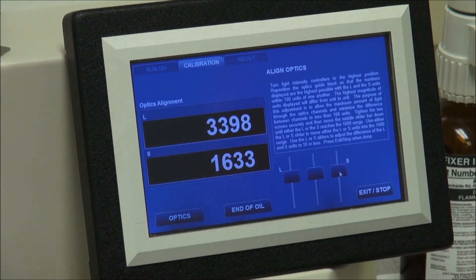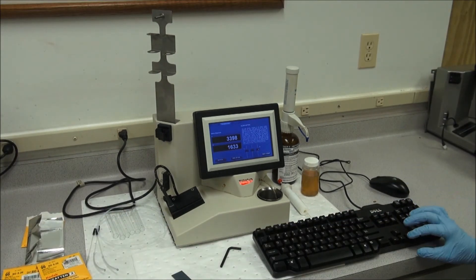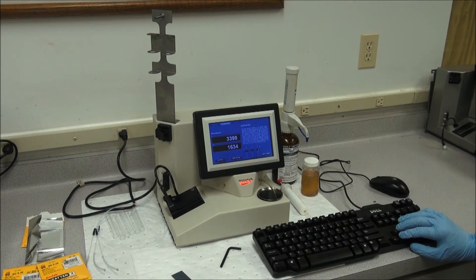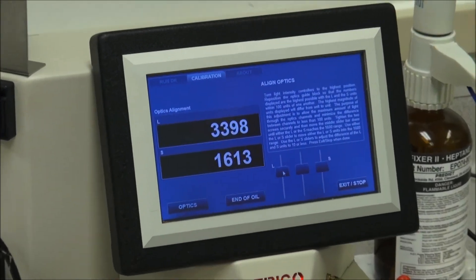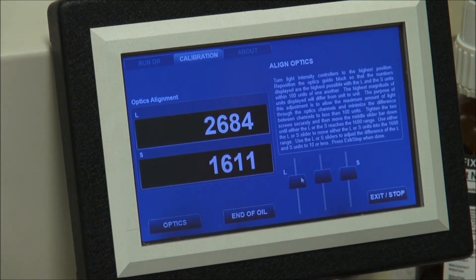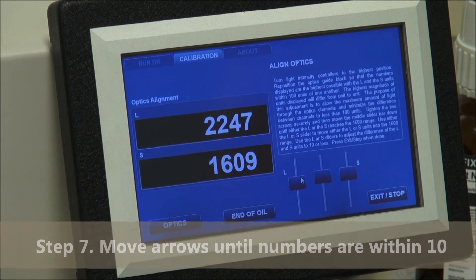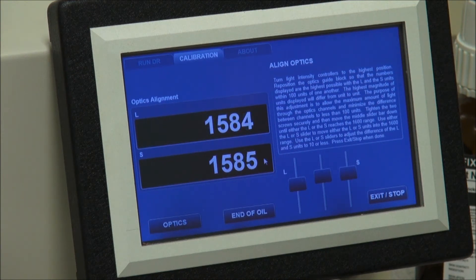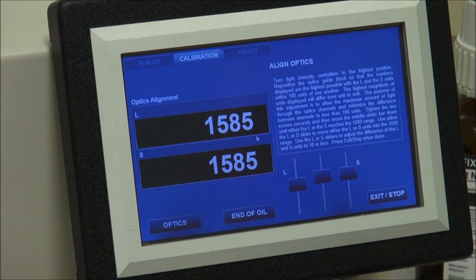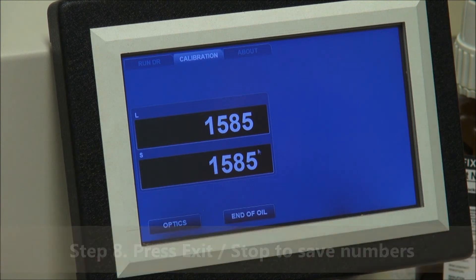Once the L or the S are in the 1600 range, use the left or the right slider bar and the keyboard up and down buttons to adjust with finer adjustment. Move each button until the L and the S numbers are within 10 of each other. Once both are within the 1600 range and within 10 of each other, press exit and stop to save your numbers.